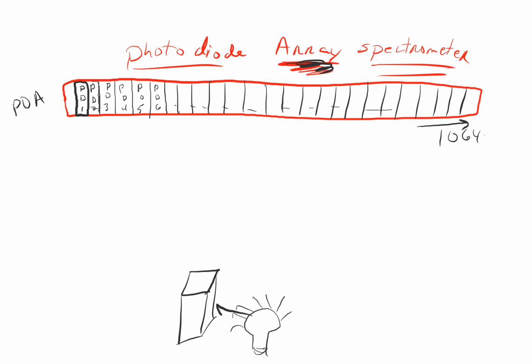Pass the light through your cuvette, out the other side. So this is your sample S, okay? Out the other side. And let's just say that you've got one of those gratings here. I'm going to draw it at an angle just to show the reflection off of it, okay? But this is one of those diffraction gratings that we talked about, that we build the monochromator out of, right?